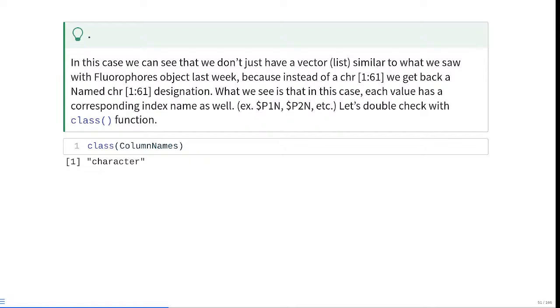So when you find something odd and you're trying to troubleshoot what's going on, just try to get a couple lines of evidence as far as what this object type may be, just to make things a little bit simpler for everybody.